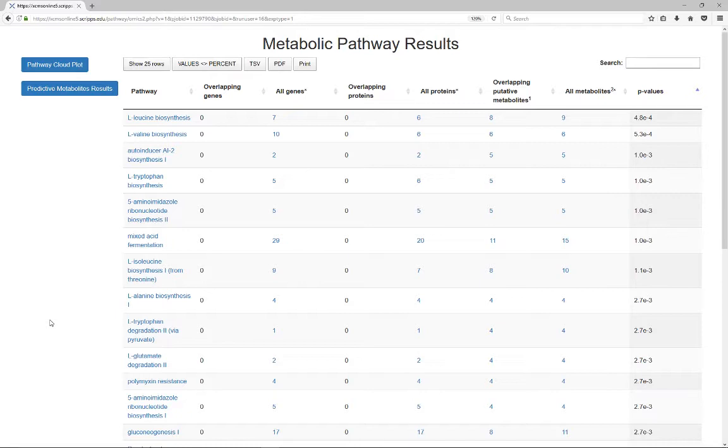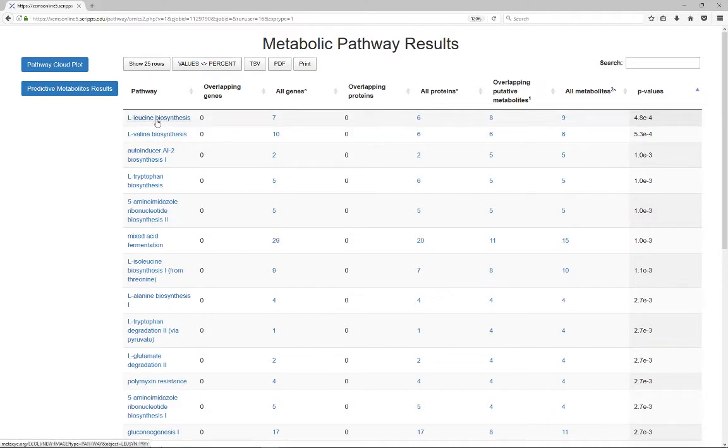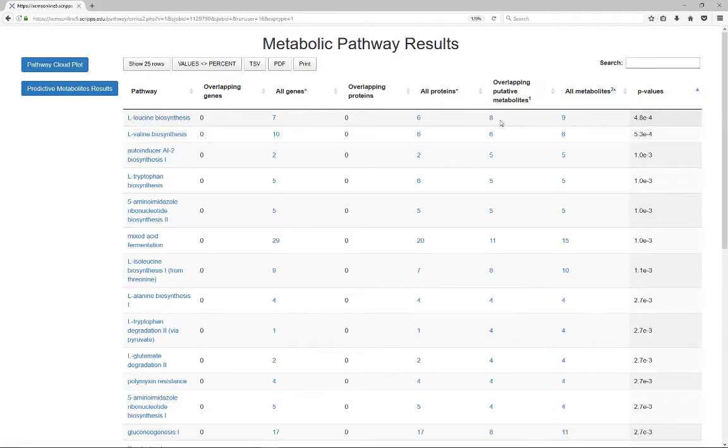This systems biology results tabulates all the predicted pathways together with the involved genes, proteins, metabolites, and pathway p-values. Each item in the table links to additional internal or external resources if you need more information.